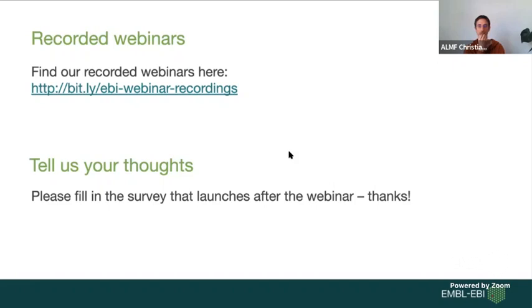Yeah, thank you. Which software would you recommend for analysis of macro images? Oh, so I haven't worked with this, and I don't think that qualifies for a specific recommendation. I think all of these platforms could work. If the images are really, really big, and also it looks like you might have a color camera image, maybe QuPath. Maybe QuPath is your thing. I'm not sure. Try QuPath.